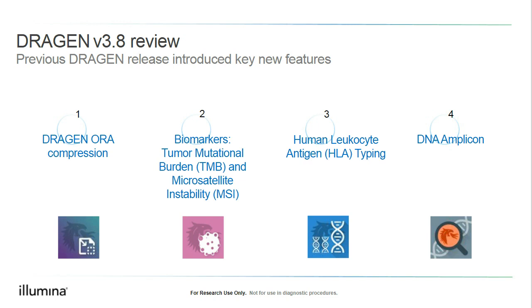As I mentioned earlier, we are bringing in more biomarkers with every release. So in the previous release, we had introduced the TMB and the MSI biomarkers, and in this one, we are bringing in the HRD. We also have made updates to the HLA pipeline, and the slides are in the appendix section of the updates that we have made. So please feel free to review those once the webinar is over.